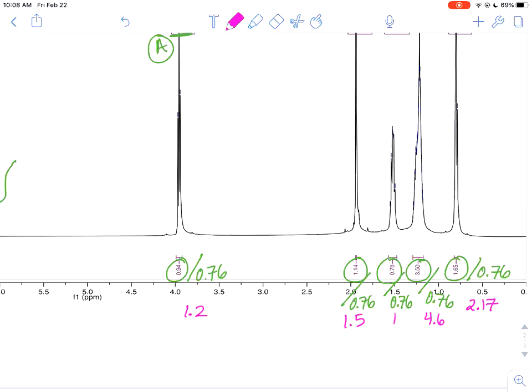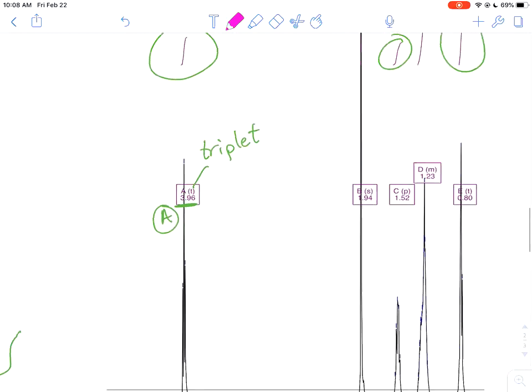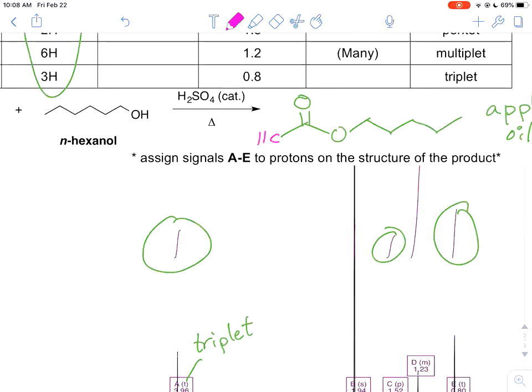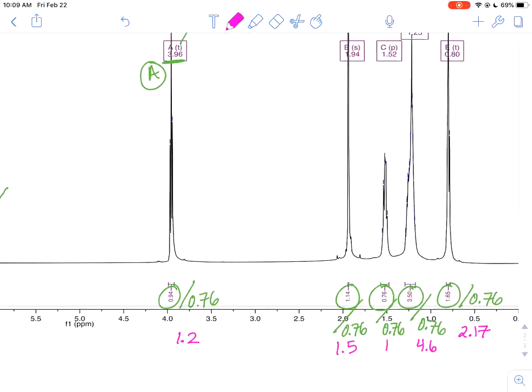So I went ahead and divided each of those integration values that are provided by 0.76. And we can see that we're starting to get somewhere near the number of protons that we're expecting in the molecule. If we take a look at our structure, however, I'm just going to draw on these. We have a CH3 group, we have a CH2 group, actually we have a bunch of CH2 groups, another CH3 group. So there's actually no CH groups that we're expecting. We're not expecting a one hydrogen signal. So I'm going to go ahead and multiply all of these by two. And we're starting to get a little bit closer to what we're expecting.